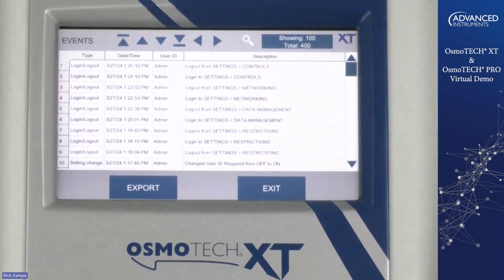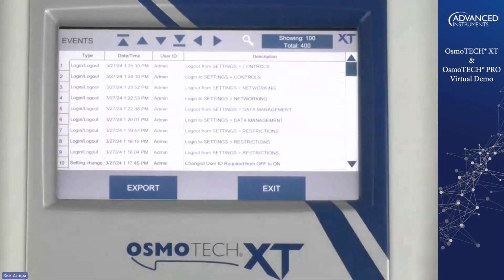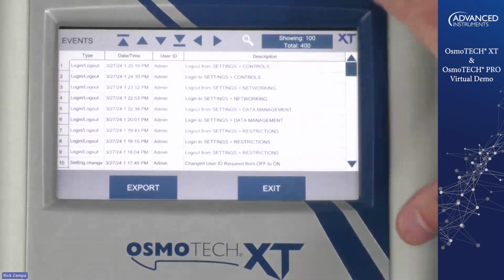And this is very important when you're talking about your data integrity and data management. If you're looking at capabilities of, let's say, an environment where you're being audited and the FDA has a question about a test result, they'll always want to go back to the original source of the data to confirm that test result. The instrument is always your original source of data, and the results always stay on the instrument. Even if you're backing it up, even if you're exporting it, they never come off the instrument and they can never be deleted.